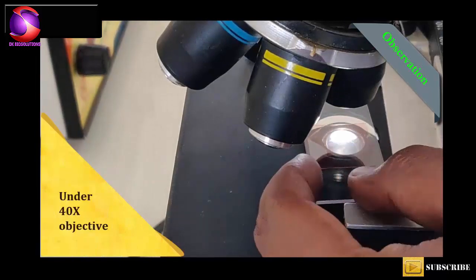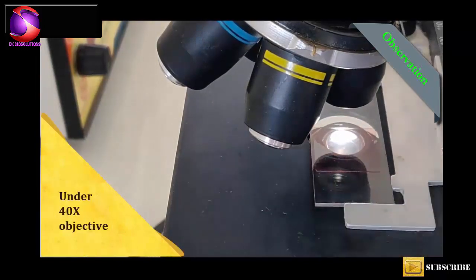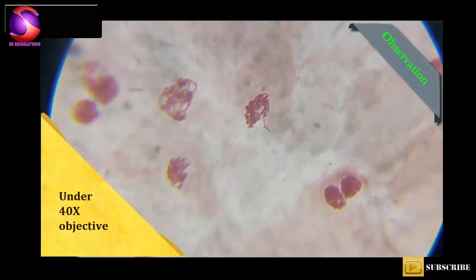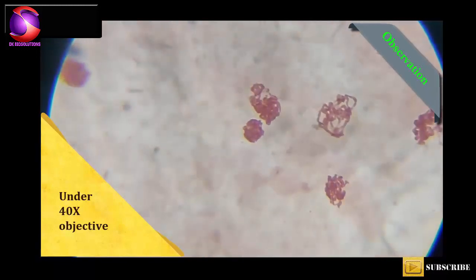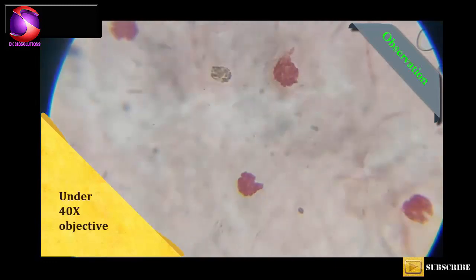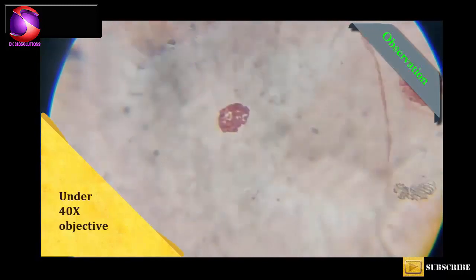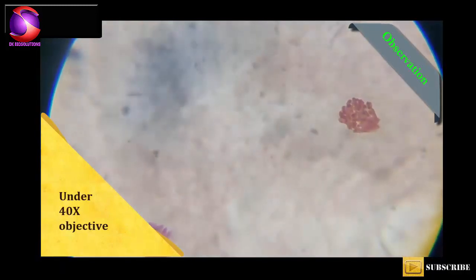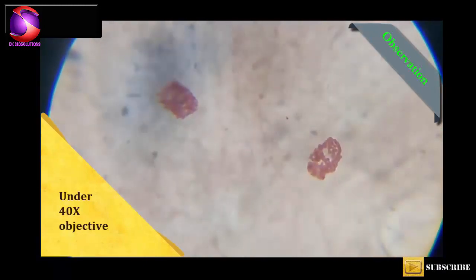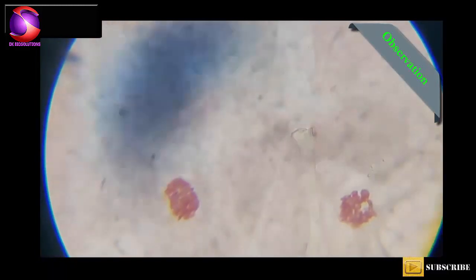Now our slide is ready to observe under the microscope. Observe the stained polytene chromosomes.